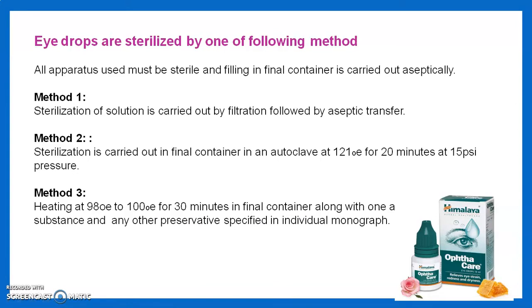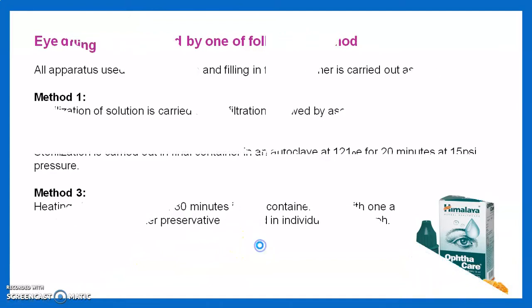Eye ointment is sterilized in the hot air oven. For that purpose we use the hot air oven.